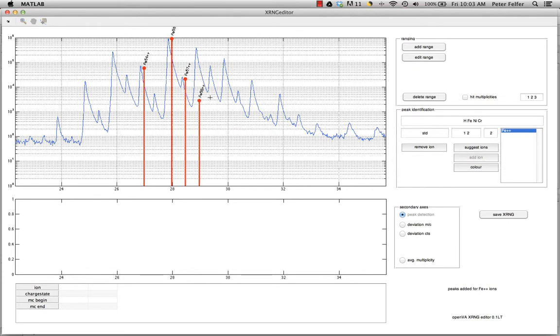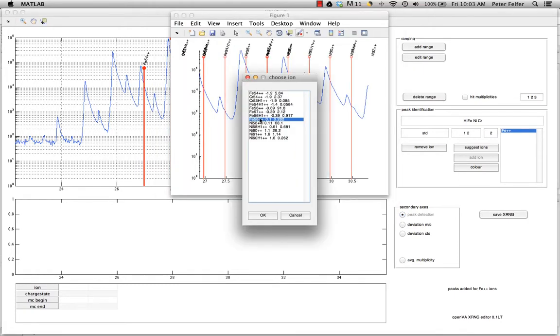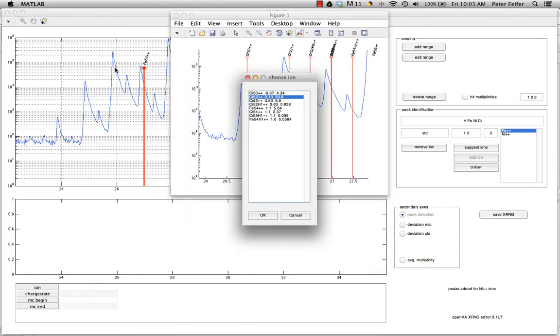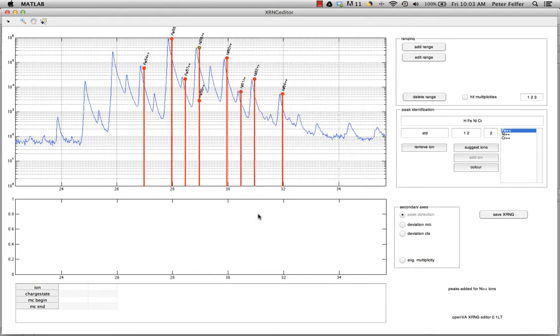Now you can actually use the hotkeys. So press P to mark that peak here, and iron 58, it's probably not that. So it's probably nickel 58. And if we're right, the peaks of the other isotopes should pop up properly. And they do, so that's all good. And that peak here is, I suppose, chromium, yeah, chromium 52, all good. Choose that, and we've got the chromium peaks.